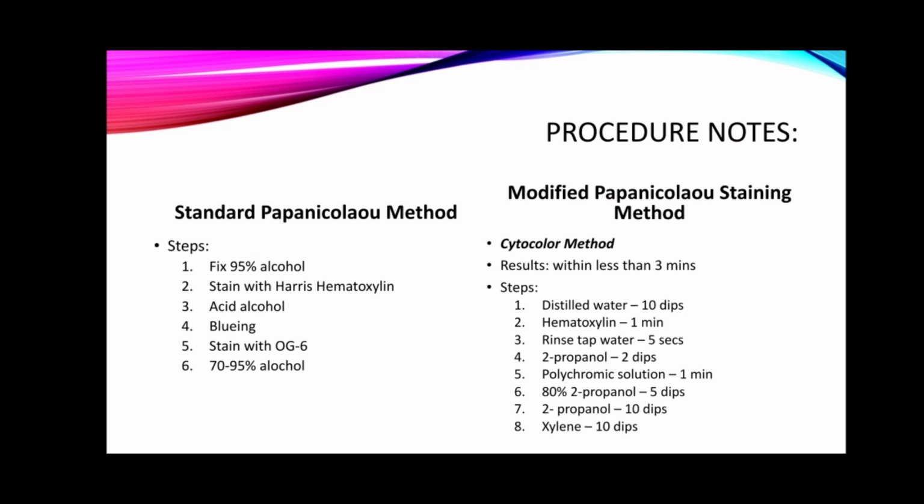You may want to ask me, class, why there are different techniques in doing the PAP staining method. It also depends upon the manufacturer, class. So whatever is written in the package insert of your staining reagent, you have to follow it. So it doesn't necessarily be like what I am teaching here right now because it really depends upon the manufacturer. But somehow the principle, its usage, and its importance is still totally the same.